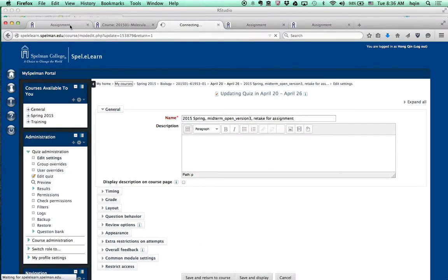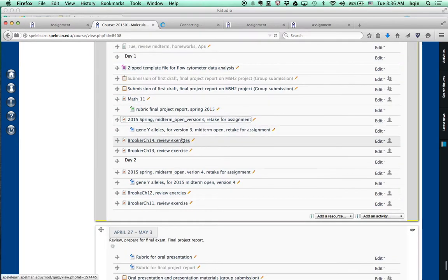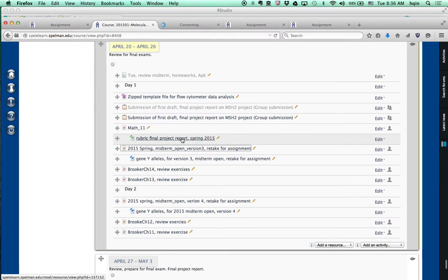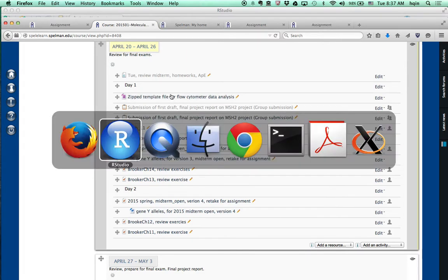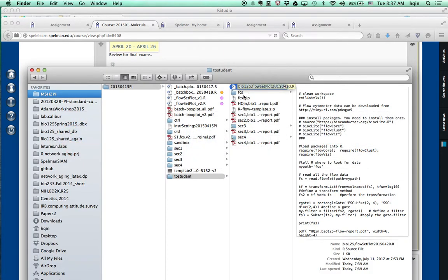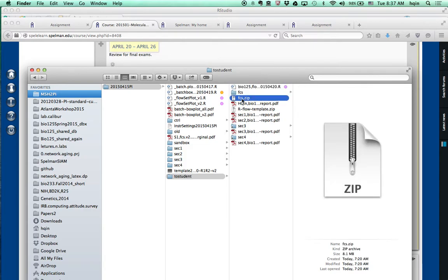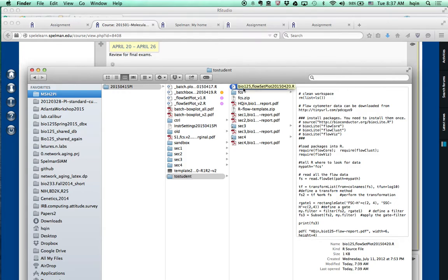This is a demo to show how to analyze flow cytometry metadata. On Moodle, the template file is in zip format. Download that file and expand it. In that zip file, you will see two files. One is called fcs.zip, the other file is a template R code called bio125 flowsetplot2050420.r.